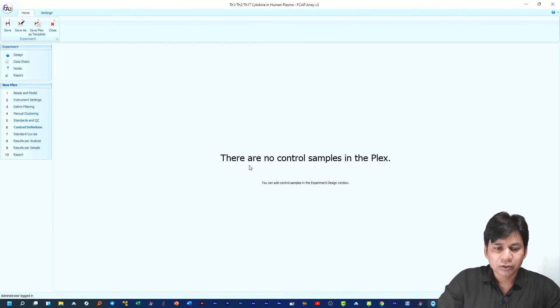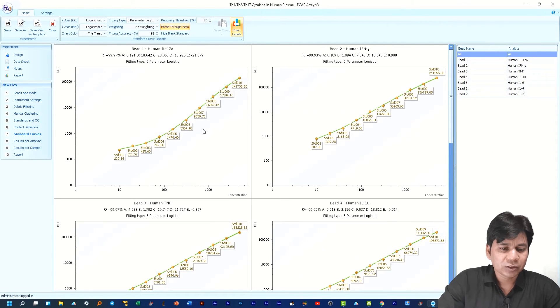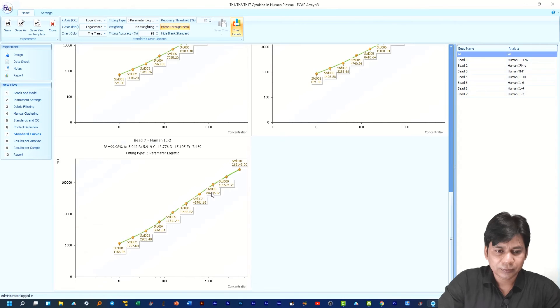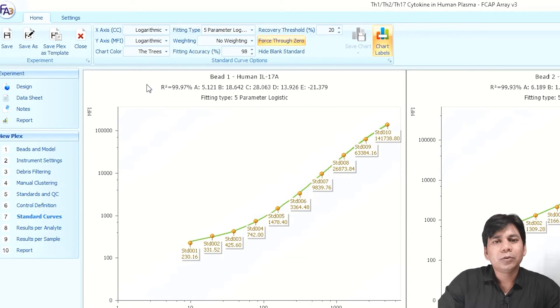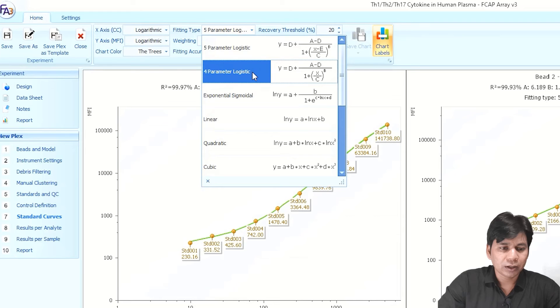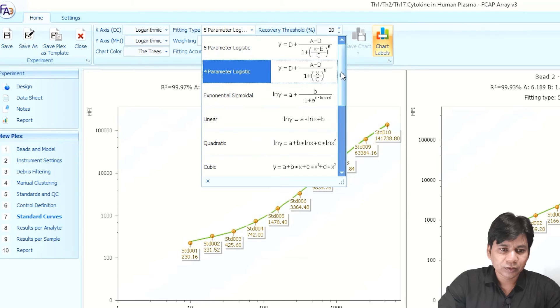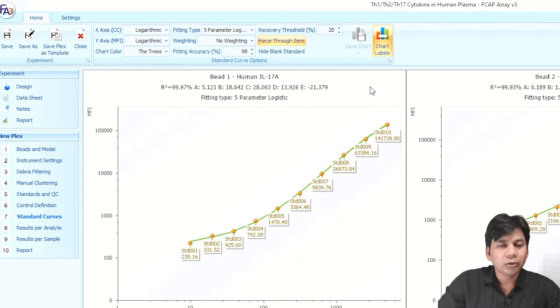After Standard and QC, click on 'Control Definition.' There are no control samples in this Flex set, so I am clicking 'Standard Curve.' You can see that FCAP Array software has prepared the standard curve for all seven cytokines. The parameters shown include an R-squared value of 99.97 and fitting type of 5-parameter logistic. You can adjust the standard curve fitting by clicking on the fitting type — there are other options such as four-parameter logistic, exponential, sigmoidal, linear, quadratic, cubic, and more. You can select the curve fitting type that gives the best result for your experiment.